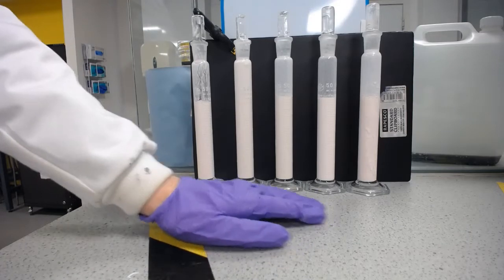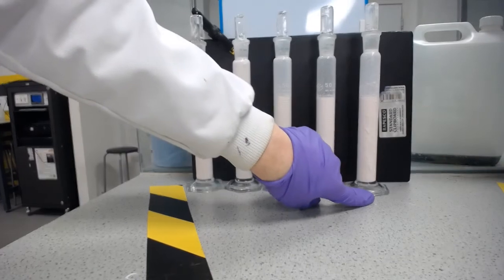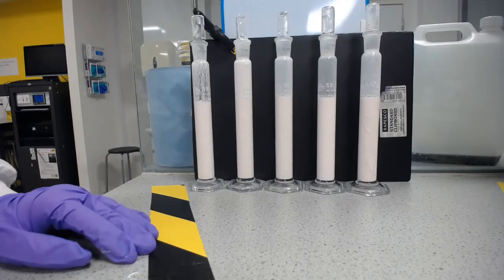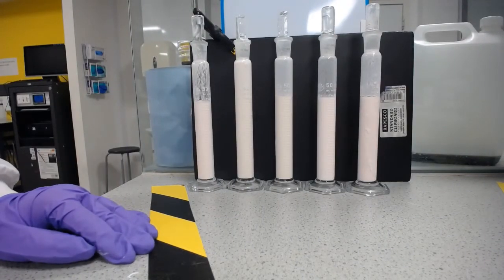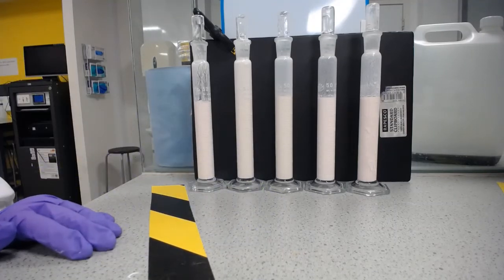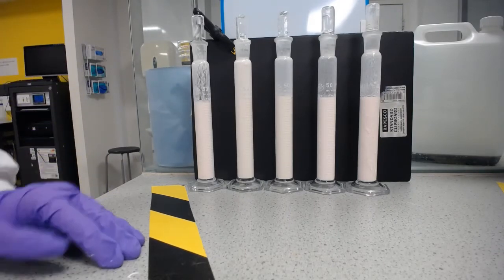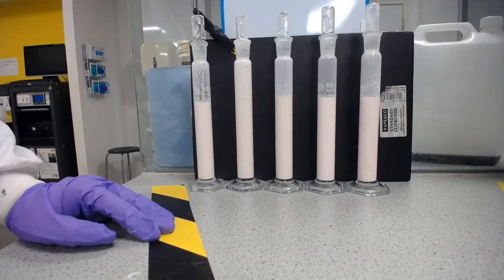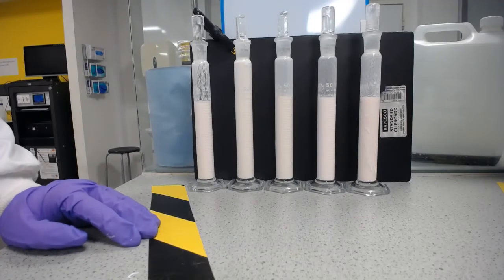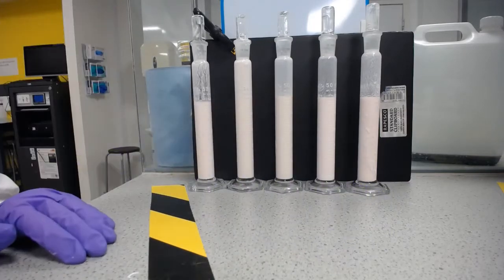So what we can see here is that maybe this has flocculated and this has gone further and deflocculated. So we've got some caking going on at the bottom. Not so good. So we'll have a look at this in more depth in a bit. But whilst we're in the lab, my quick thing would be formulations with bentonite in them have been more stable, but maybe over a long time they would have cake potentially. I don't think so. And formulations with trisodium citrate only, not bentonite, have split more. And when we've gone too much trisodium citrate, sounds like an electrolyte, doesn't it? We've got deflocculation.